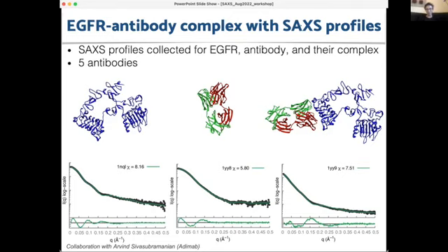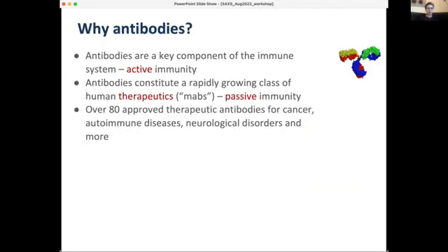No. So based on those lines, we don't like it here. We can clearly say it doesn't fit. The chi is also very high. So they don't fit the data very well, and this is with crystal structures. And so what is going on?